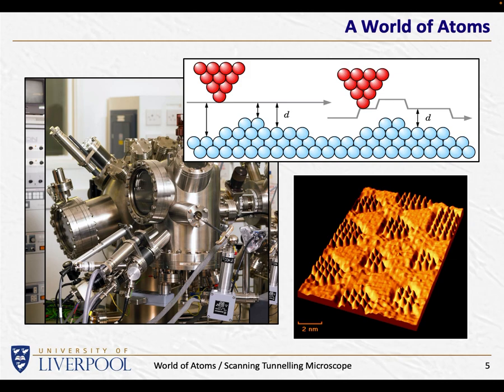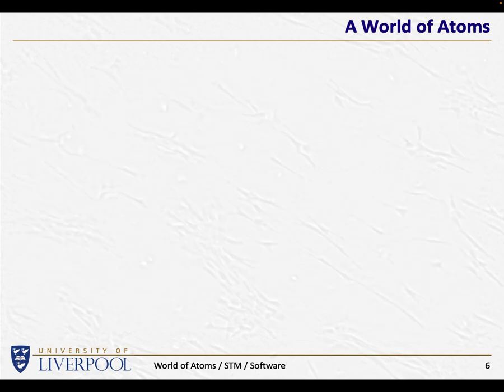This is, of course, very important for those that want to study corrosion and what happens at the surface of materials, whether it be metals or semiconductors or other materials. So this is what I started doing in the 1990s, using microscopes to look at surfaces.